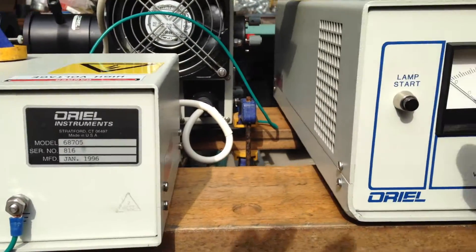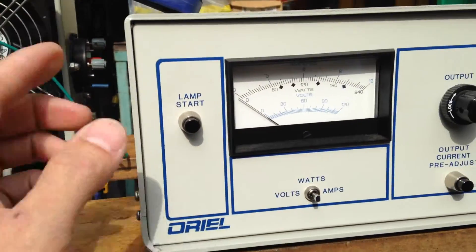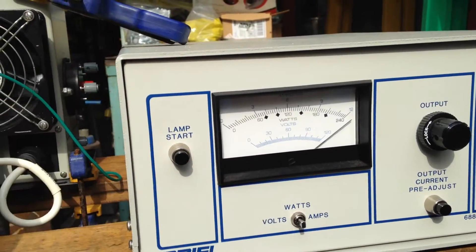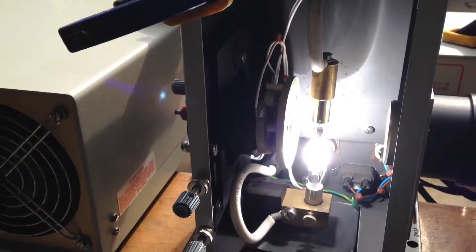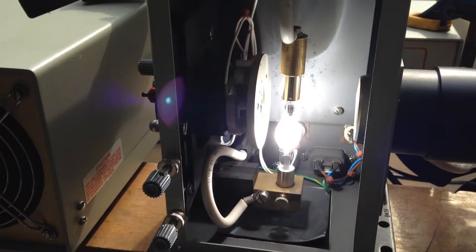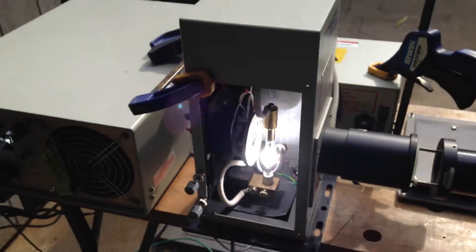So you're going to push the lamp start here. Boom. And it's up. Go over here — and the light is on. It is very bright. So there it is. It works.